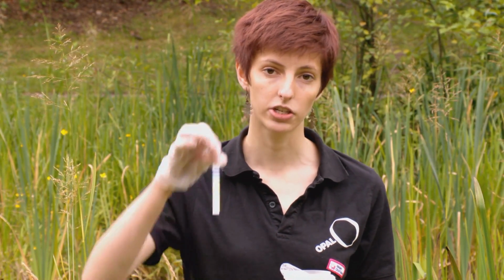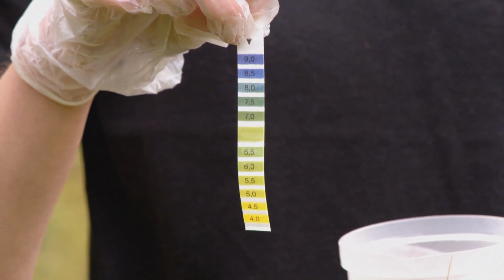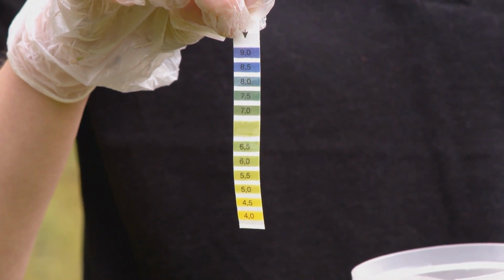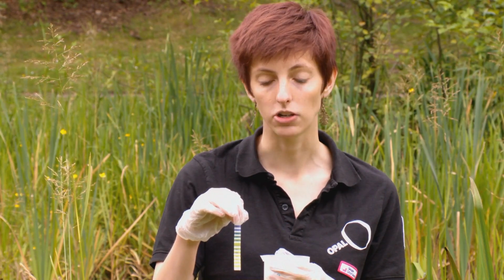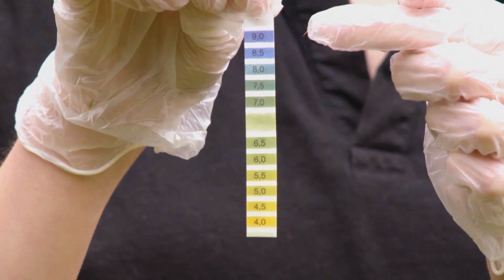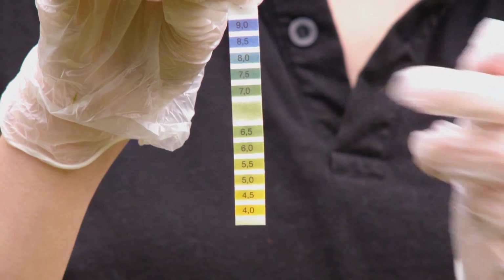To test the pH, hold the strip by the arrow at the top. Dip it into the water for around about 3 seconds, making sure you're getting the indicator strip wet, and then remove it. Wait for the colour to develop for around about 2 minutes to get the proper pH reading. The strip in the middle will change colour to match one of the other colour strips on the pH strip. Anything more yellow is acid and anything more blue is alkali. This one's nice and green, meaning the water in the pond is neutral, which is good news for the animals and plants living in there.